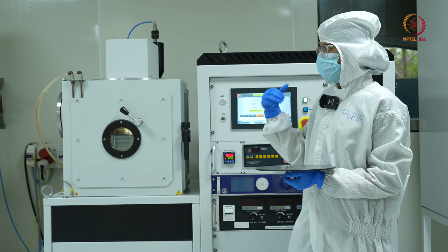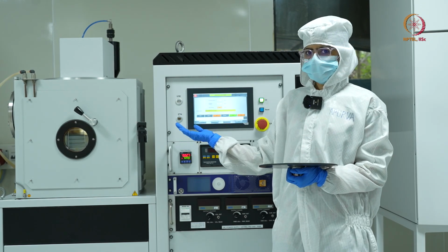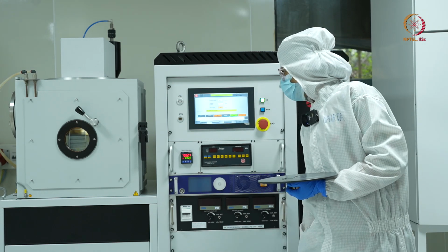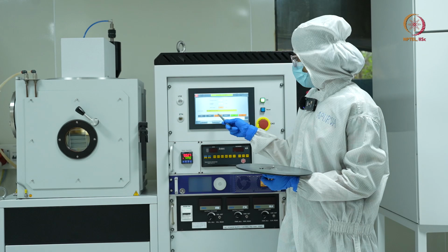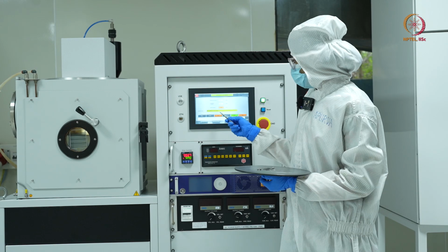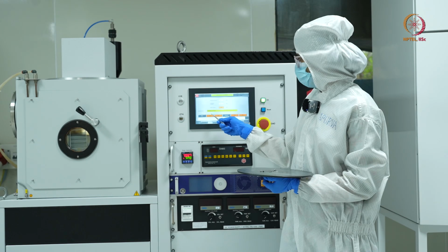Why? Because ideally this chamber should always be in vacuum condition. So as the chamber is now at atmospheric pressure, I need to put it back into cycling. So again I'll press cycle. Before that, I have to again isolate my pumps and the chamber. For that, I'll press seal and I'll keep my chamber for cycling.